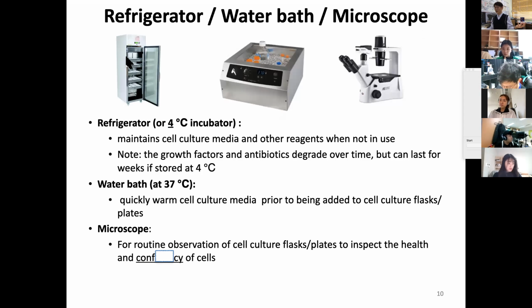We just call it fridge, okay? What does it do? We keep the cell culture media or other reagents here when not in use. It's the same as why we have a refrigerator at home, to keep our food, okay? Growth factors and antibiotics degrade over time, but they can last for weeks if stored at 4 degrees C.